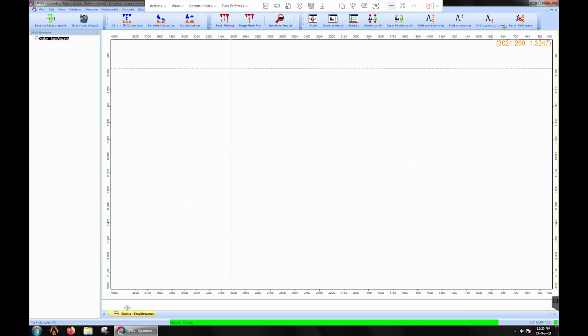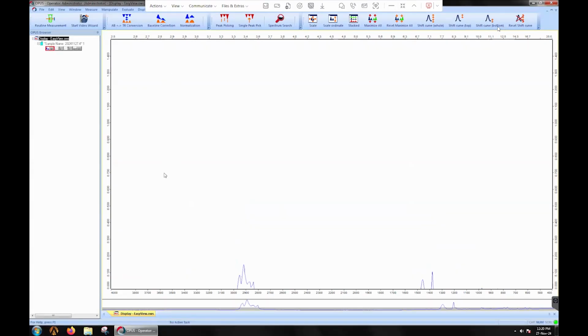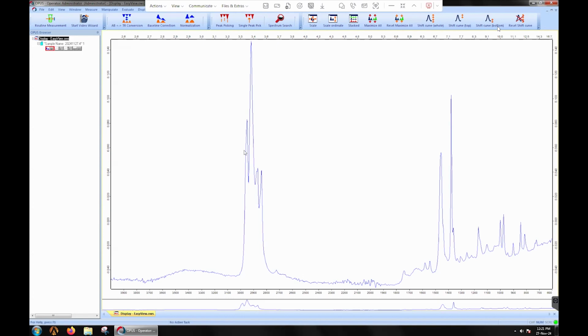And once again, we won't see the live spectra being acquired, but in the bottom of the software, we see the acquisition proceeding. With the acquisition finished, we now get our data presented to us in the browser, and we can see part of the spectrum here, but we can't see everything. What we are going to do is click on the Scale button in the toolbar to scale the spectrum to the full screen. And here we can see our acquired ATR spectrum.